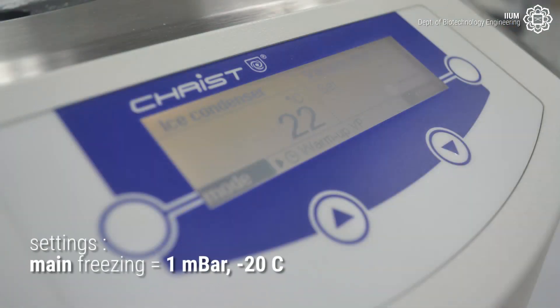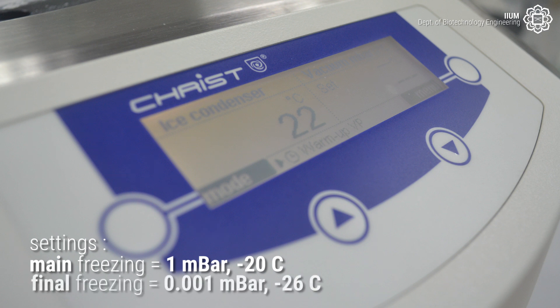Set the main freezing to 1 millibar at minus 20 degrees Celsius, and the final freezing to 0.001 millibar at minus 26 degrees Celsius.